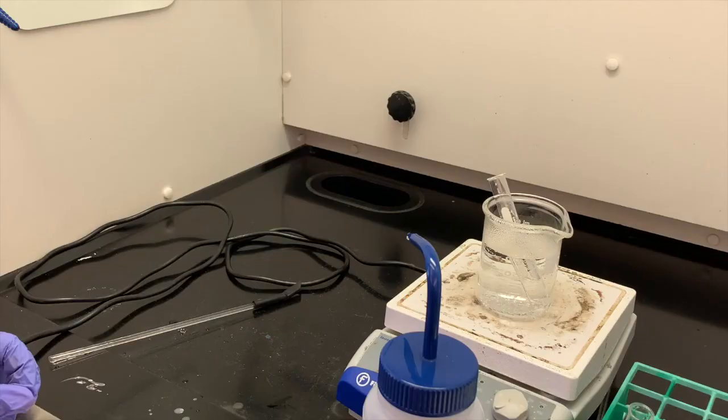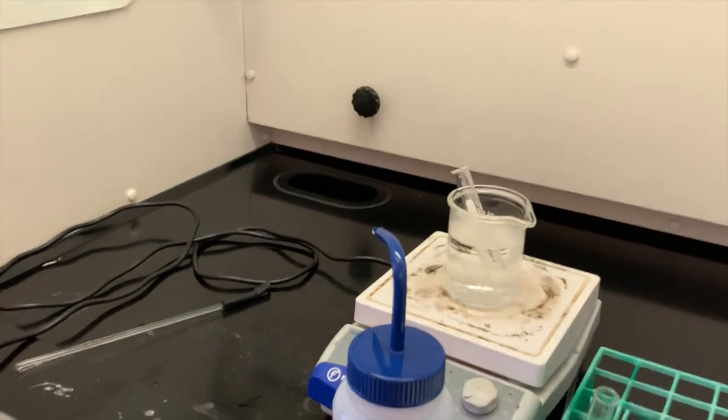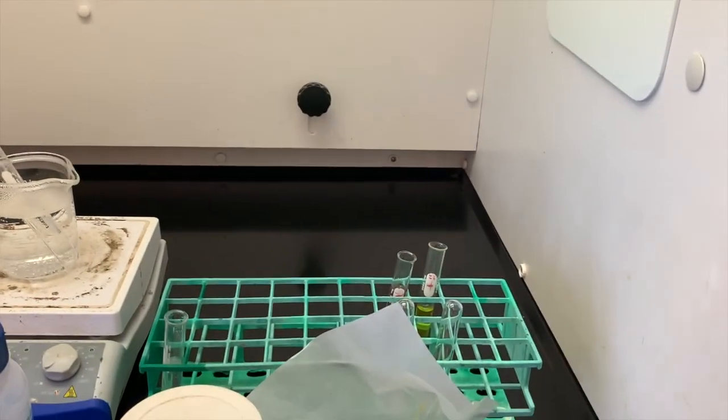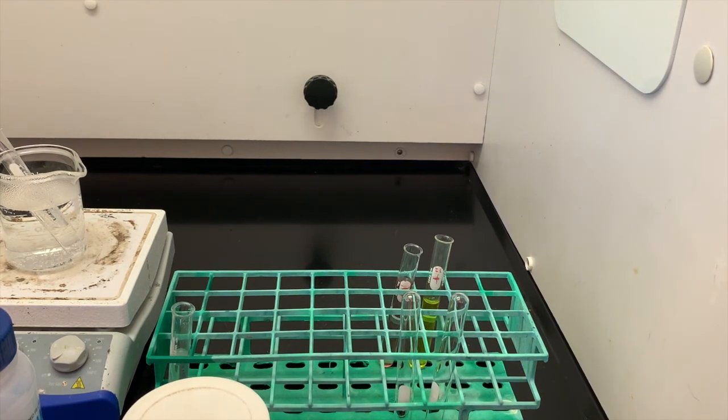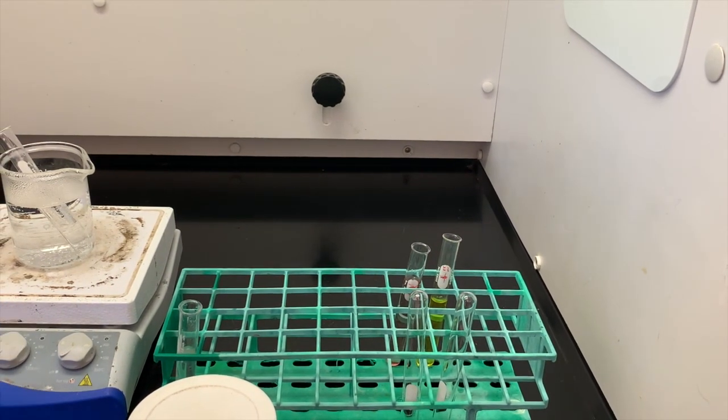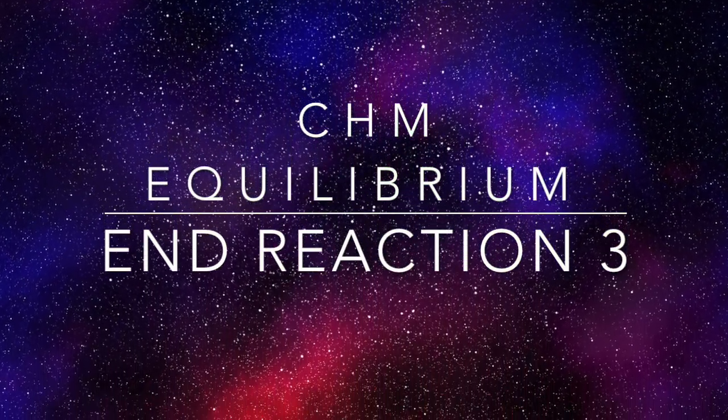So I'm just going to make sure that I clean up all of my test tubes, put them into the correct waste containers, and then I will wash those test tubes with soap and water. Okay, so this is the end of the chemical equilibrium's lab.